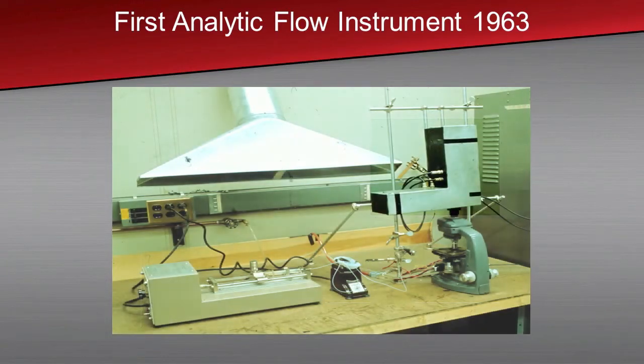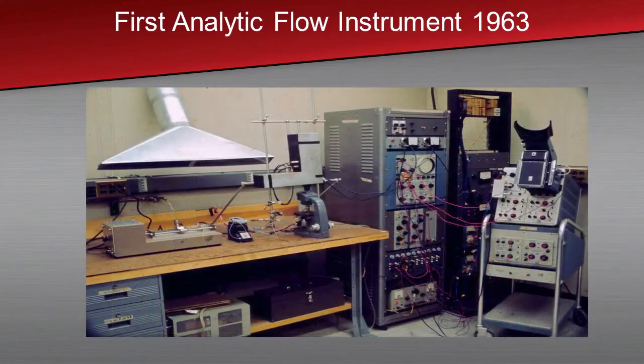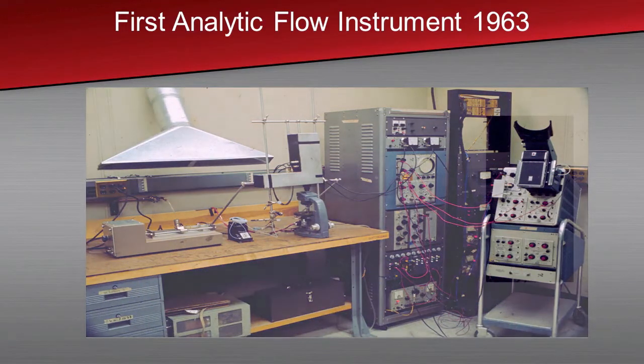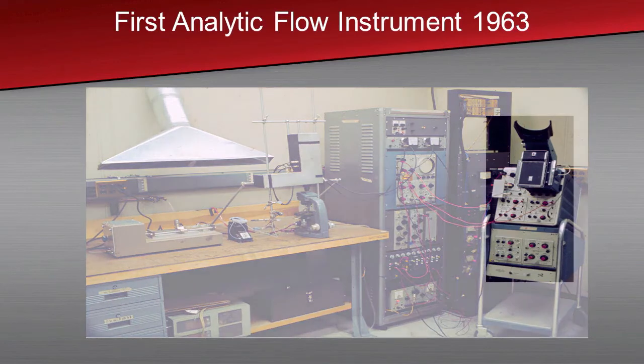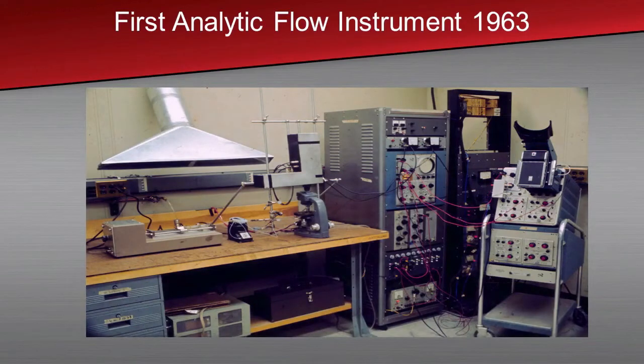Back then you used stuff that was used in nuclear physics to get pulses, and there was a rack of equipment on the right. You ended up with the display on an oscilloscope with a Polaroid camera to take pictures. There weren't memory devices back then of any kind, so your memory was a Polaroid picture. I probably ended up using more Polaroid picture film than anybody alive back then.